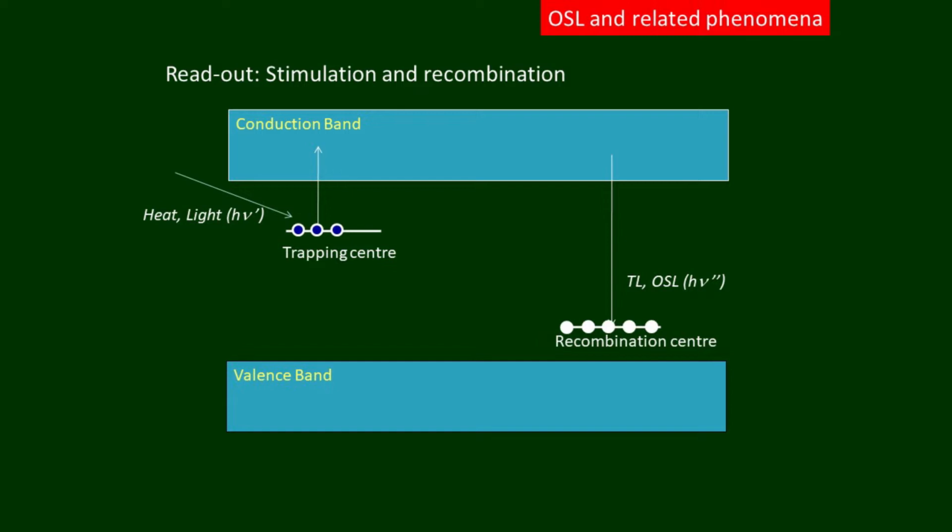That luminescence corresponds to the concentration of trapped electrons. For example, if one photon comes out, that means that one photon may correspond to one trapped electron in a trap. So that's the way we read out the luminescence signals. So it's an indirect measurement. We can't measure the trapped electrons. We measure the luminescence that corresponds to the trapped electrons.